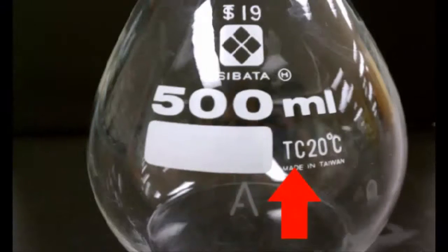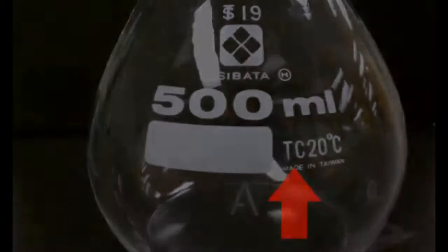The TC notation, used on volumetric flasks and most graduated cylinders, means that the markings give an accurate measure of the volume contained, but that pouring the liquid into another container will not necessarily deliver the indicated volume.